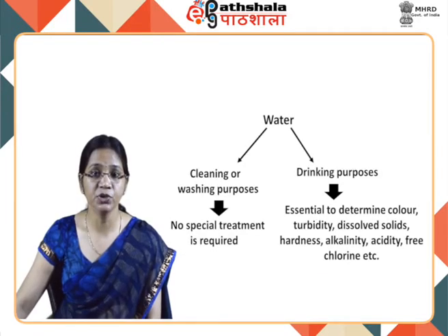The analysis of water, the most common industrial solvent, is extremely important as it contains a large number of impurities which necessarily have to be checked before the water is used for any specific purpose. The ways in which water is used are so varied that no single purity standard can be applied. If water is to be used for cleaning or washing purposes, no special treatment is required.